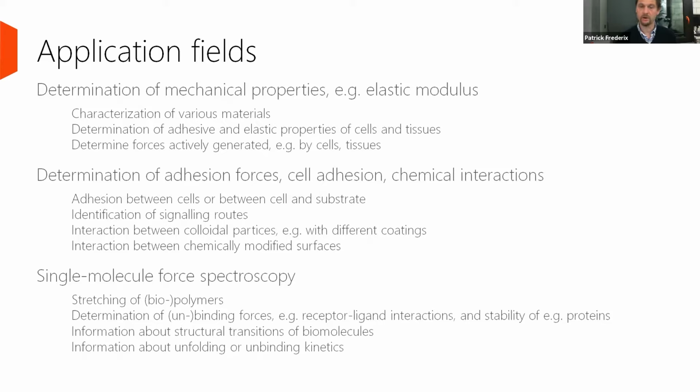And that depends on how elastic this sample is. But instead of pushing in, you can also try to pull at the surface, or pull cells away from the surface, and measure adhesion forces, or chemical interactions between a tip and the surface. And finally, if you go a little bit further away, if you have a molecule tethered between the cantilever tip and the surface, you can also measure the mechanical properties of these molecules while stretching them.